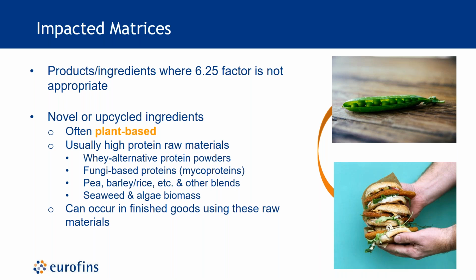So there's kind of a balance there that ends up smoothing out your carbohydrates calculation. And so maybe that is what doesn't make it as severe in the finished good, but we definitely see this for sure in the raw material products.